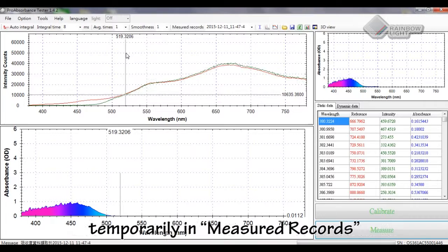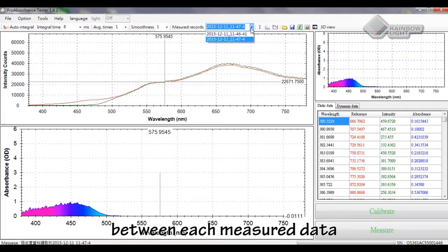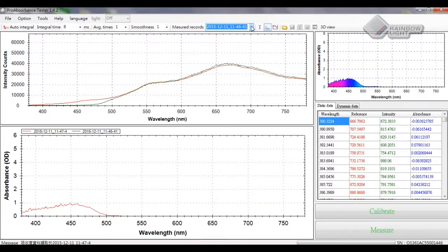This software will record each measured data temporarily in measured records. Then we can click the overlapping function to see the difference between each measured data. We also can export the measured data to Excel.